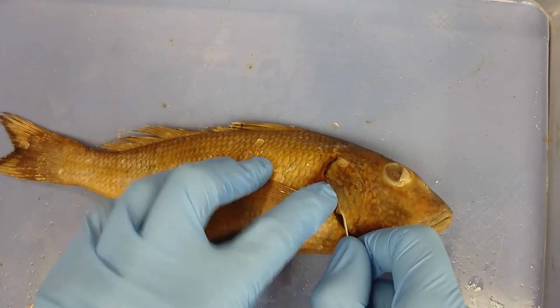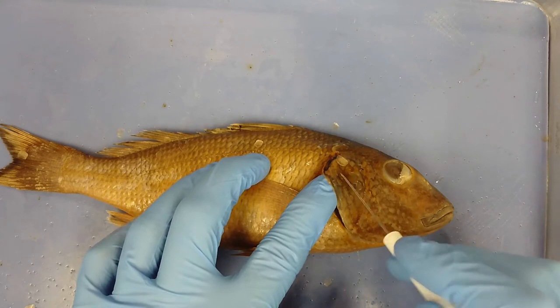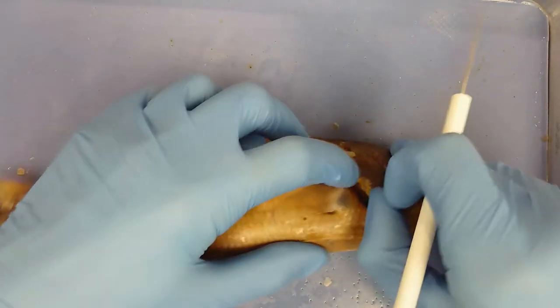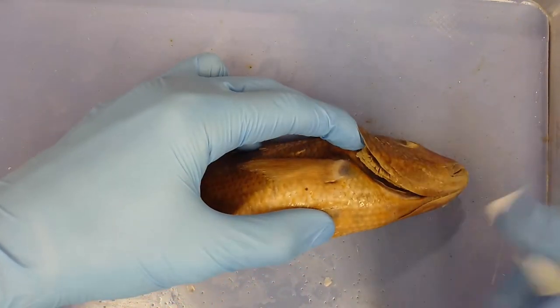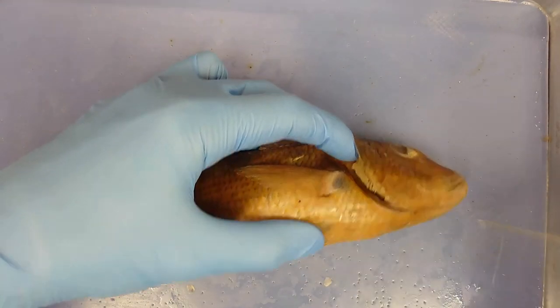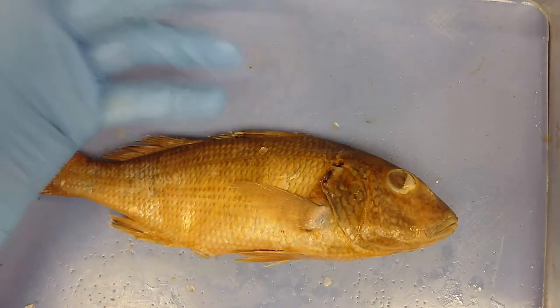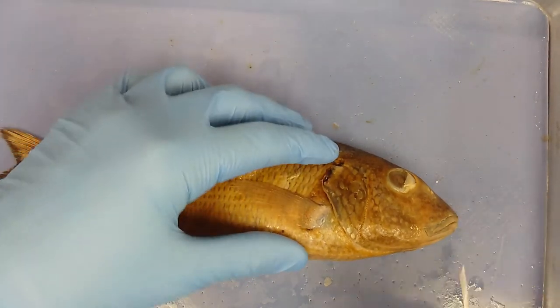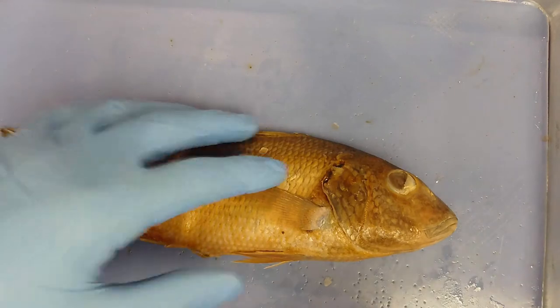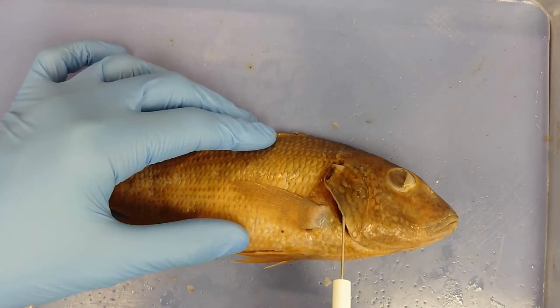This structure is the operculum or opercular flap, which covers the gills. The fish opens its mouth and water flows in carrying oxygen. It then closes its mouth and depresses its tongue, forcing the water out the only other exit — past this operculum over the gills.